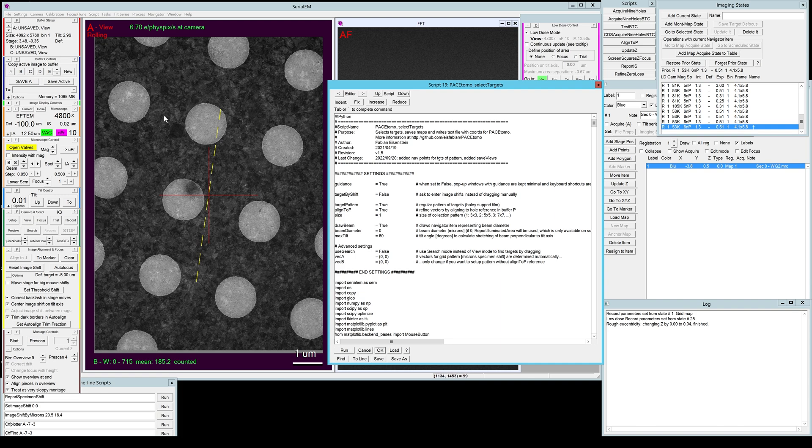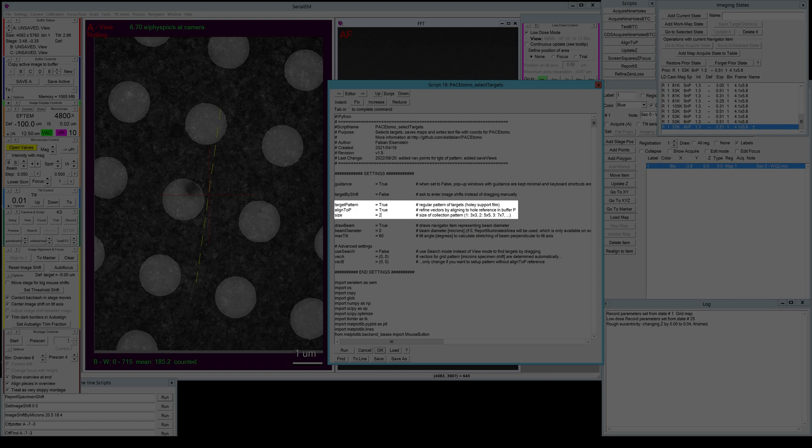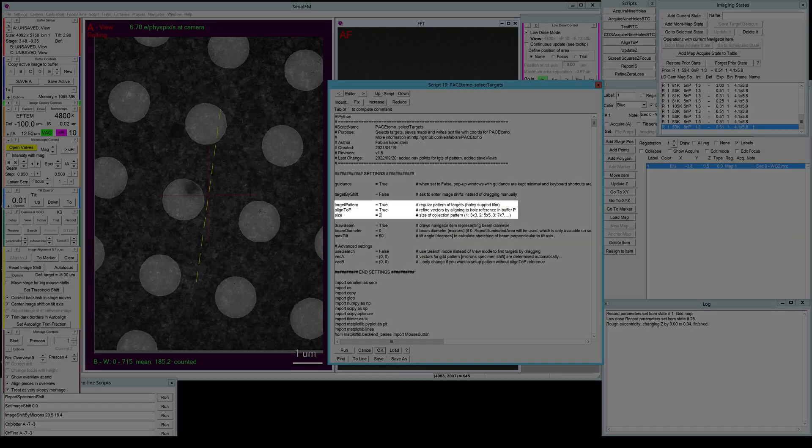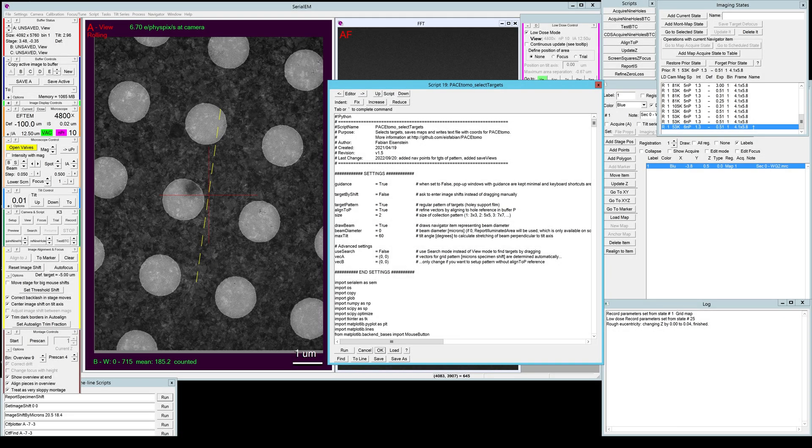The size of the pattern determines the number of holes that will be collected by image shift. If you choose one it will be a three by three so nine holes, two will be 25 holes five by five and so on. For this tutorial let's just set it to a five by five pattern.